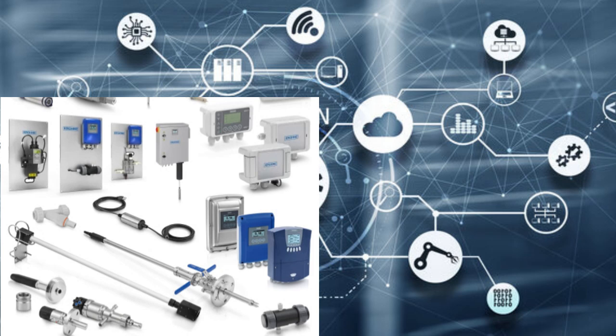This has been a wild ride so far. We've gone from lasers and water to flow assemblies and even invisible air bubbles messing things up. It's kind of wild to think how much we depend on this turbidity measurement stuff without even realizing it. It's like working behind the scenes, making sure our water is good and our products are high quality. Yeah, you don't always see it, but turbidity measurement is super important for public health, industry, even the environment.